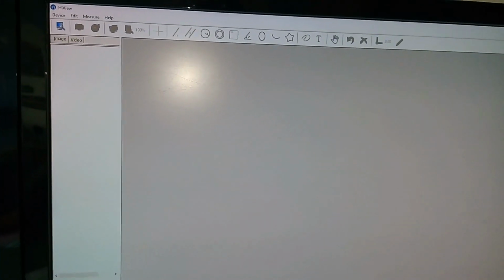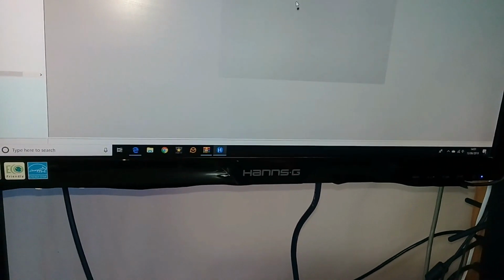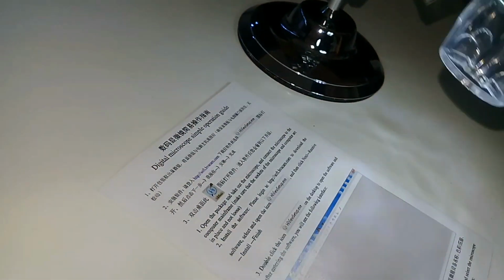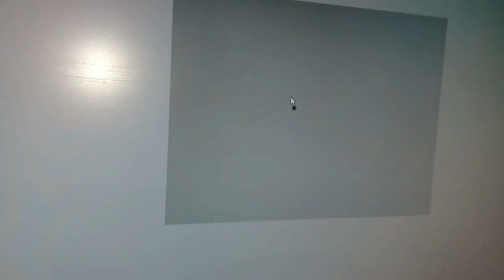We are looking a bit like no image though. Let's go and look at this device. Open. USB, digital camera, accept all the defaults. Ooh! Now it's working. Right, let me get some things for us to look at. Actually, let's look at the instructions. Methinks that I've got something on the lens. There's a dot. That would be bad. You know what I said about calibration? We may have to do it.